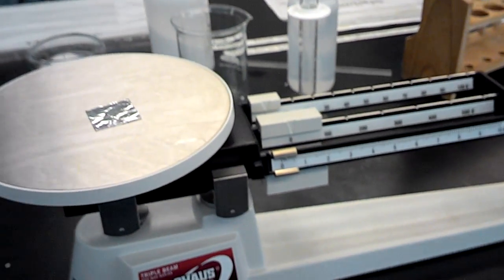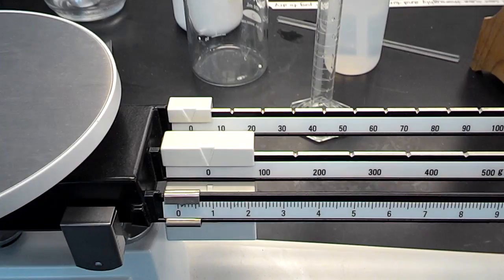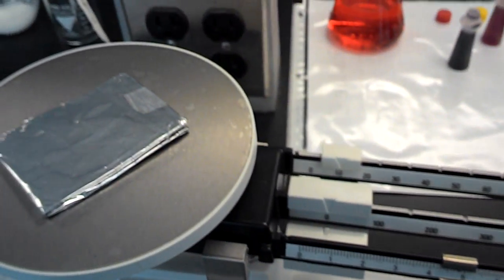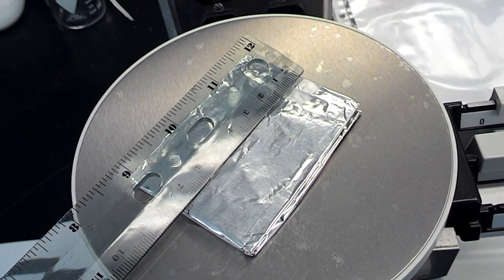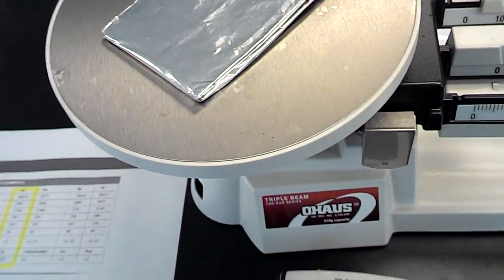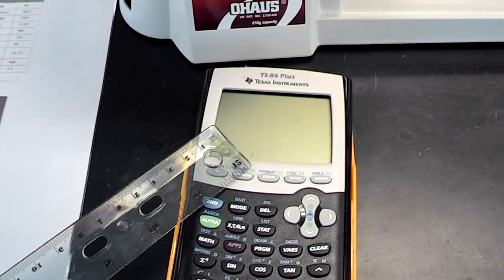For the smaller sample, you would record the mass, which is already on here. There's no tens. The mass is approximately 0.23 or 0.24 grams. Another thing it asks you to do is measure the volume. Well, we know volume is length times width times height. So you would take your centimeter ruler and measure the length, which is about 7.5, the width, which is about 3.5, and then the height, I've already previously measured, is about 0.3. So you would put those in your calculator and you would determine the volume.